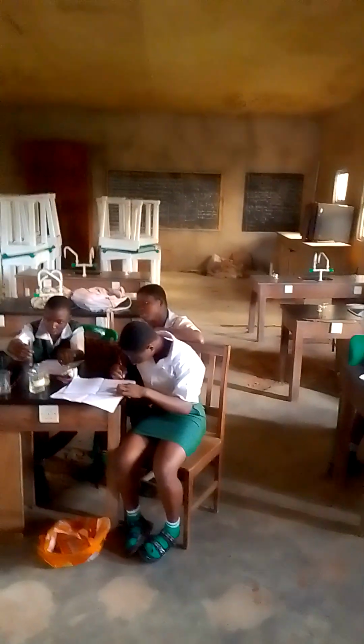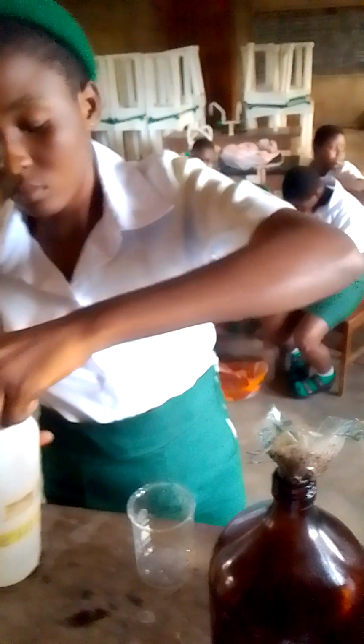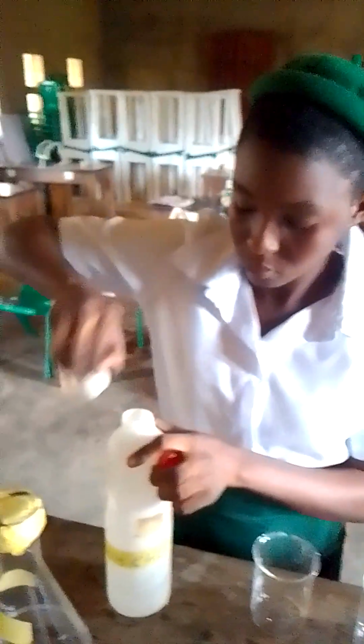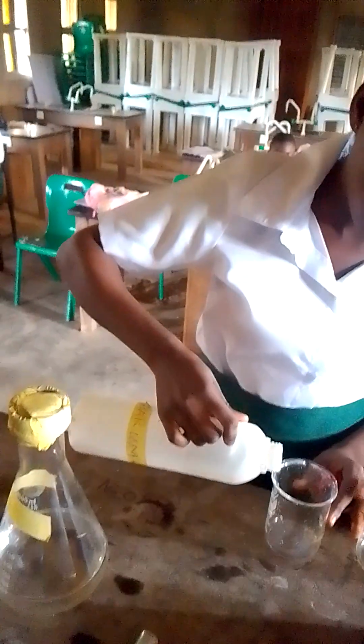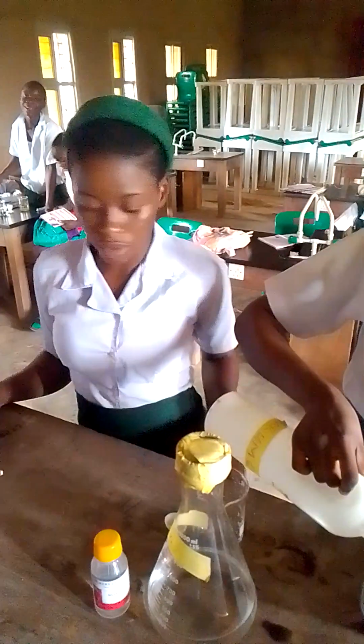Just a small amount. Then add barium chloride. Look at the barium chloride here. Come and take it too. Is that water? Okay, pour the water. Use it and come and take this barium chloride. Take the barium chloride. Open it. Shake it.